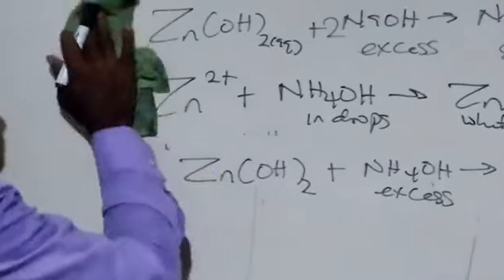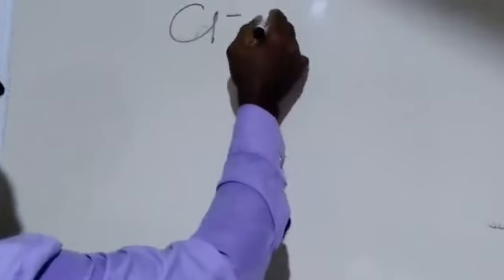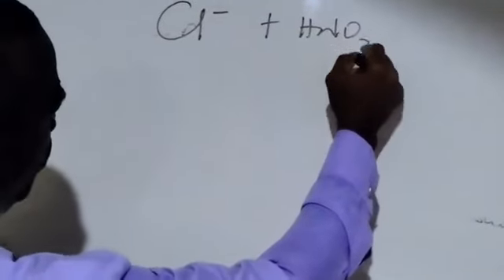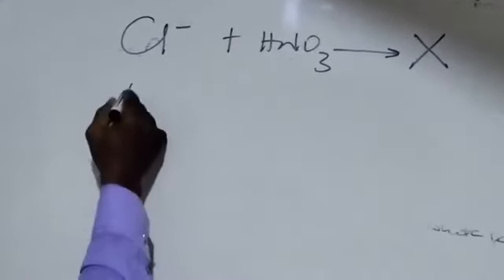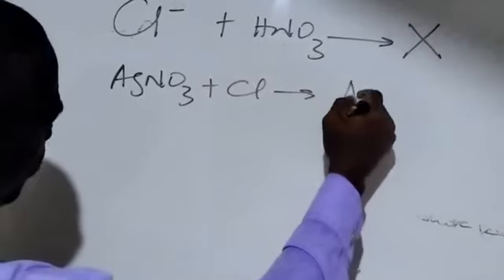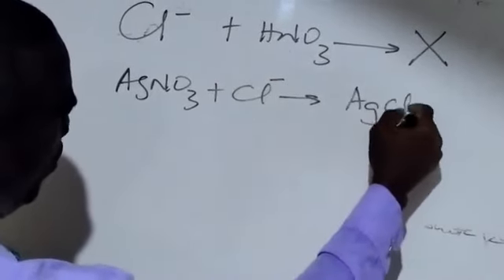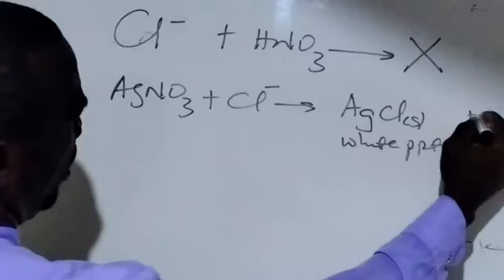So, having done that, we go to question AV, sorry, the AV is when we are asked to add HNO3. We have HNO3. We are testing for the anion. The anion is chloride ion. So we added HNO3. There was no reaction occurring because acid cannot liberate a gas from chloride. Then we added silver nitrate. With the chloride, we had silver chloride, a white precipitate, formed.